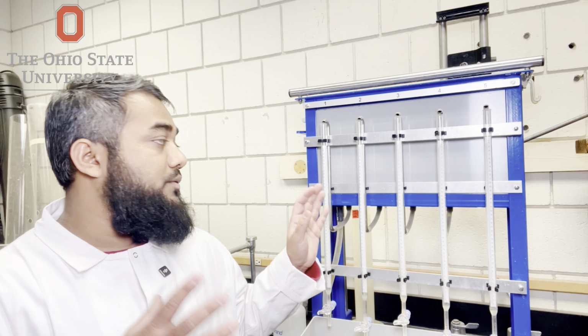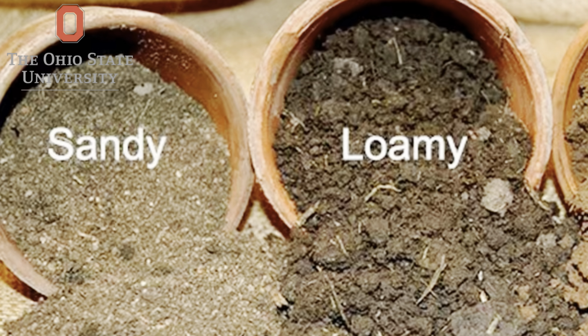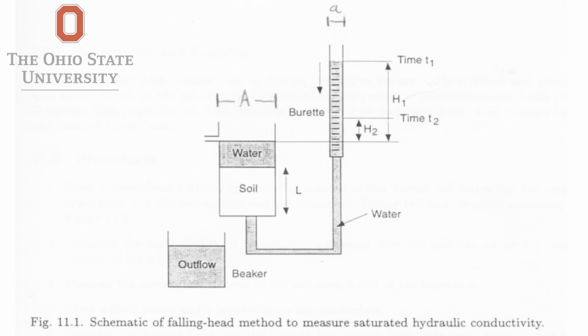But why are we using this constant head method for our samples? This method is used when soils have moderate to high permeability. Water flow can be maintained at a steady rate. This method is commonly applied to sandy soil, loamy soil, and well-structured agricultural soil. For very low permeability soils, a falling head method is preferred.